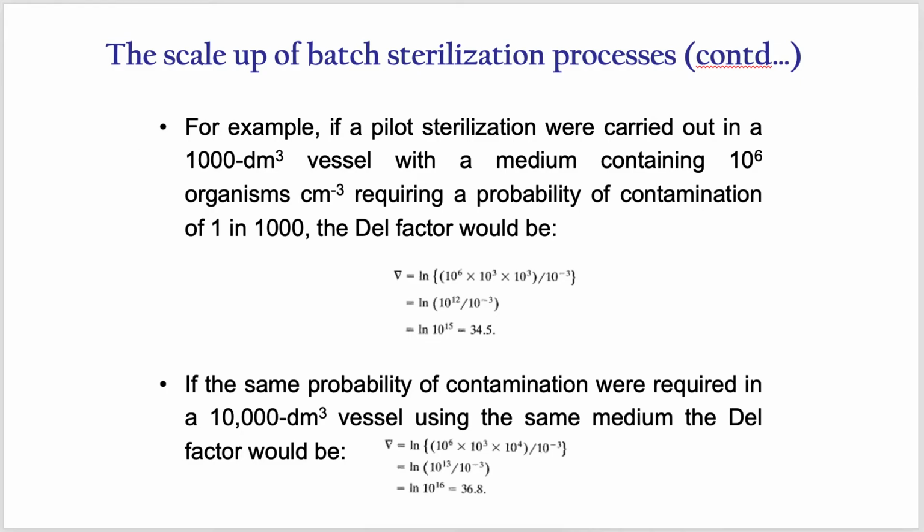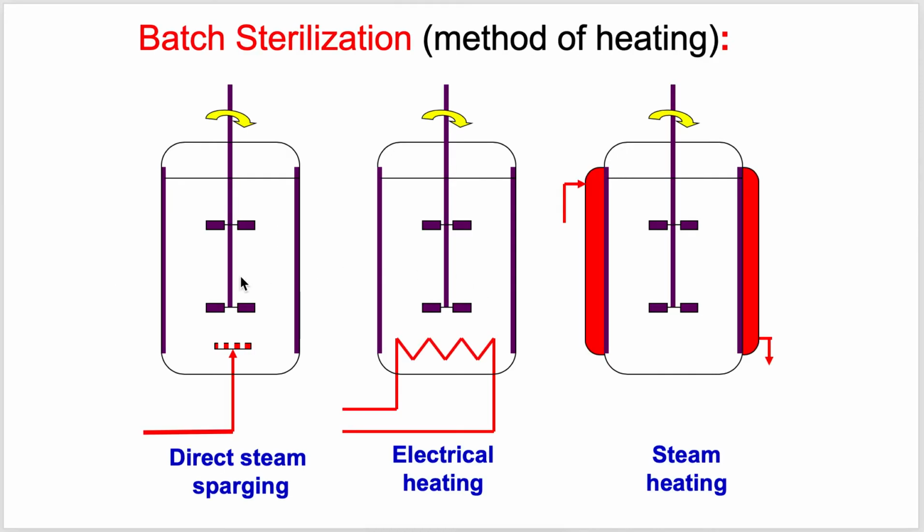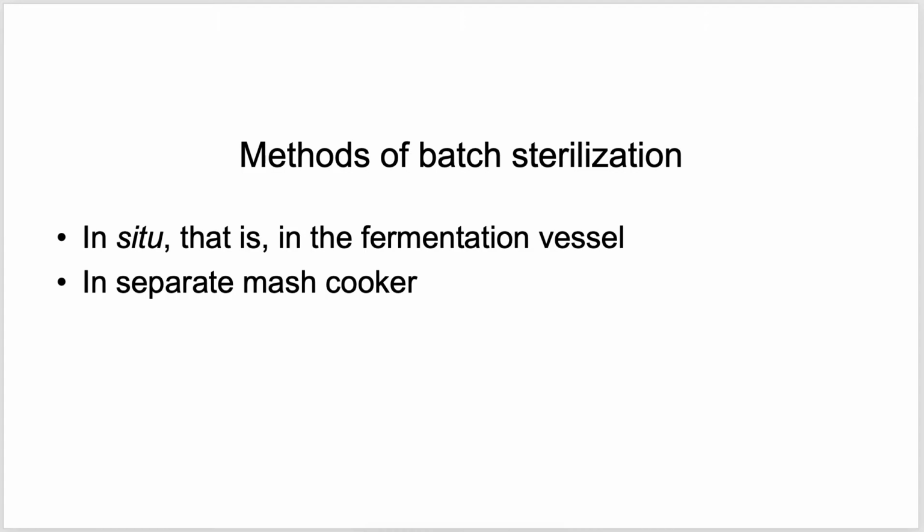Now, the methods of batch sterilization. We observed the modes of batch sterilization; these are kind of the same. The mode of batch sterilization is whether we do it by direct electrical heating or steam heating. The method refers to something different. Let me explain.